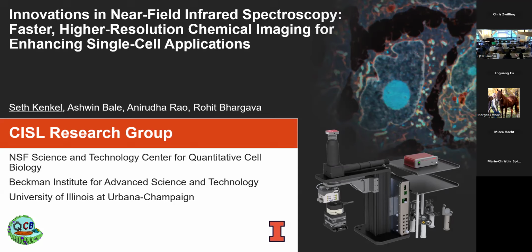It's nice in some ways to have the epoxies, because you really see where it's dark, that separates one cell from the next. But there were also some problems, I know, and you were considering different ways of presenting the cells, everything from the cryo technique that Julia Muhammad uses for tomography. But is there one that is developing along that you're more and more positive about? Like the sample prep? Yeah. Ashwin. Okay, see, I knew Ashwin should.